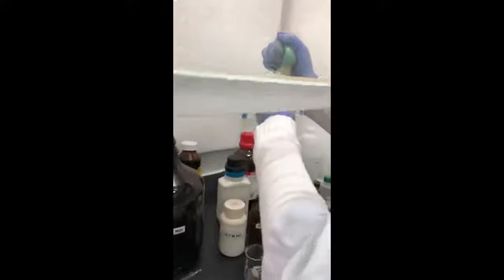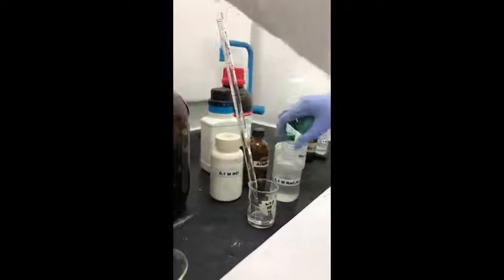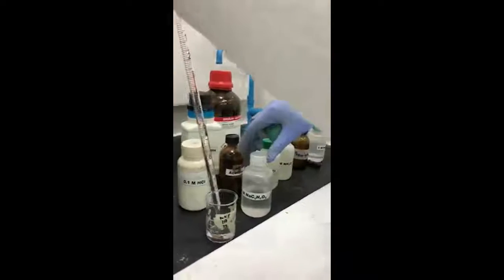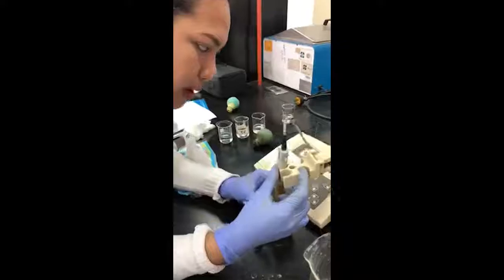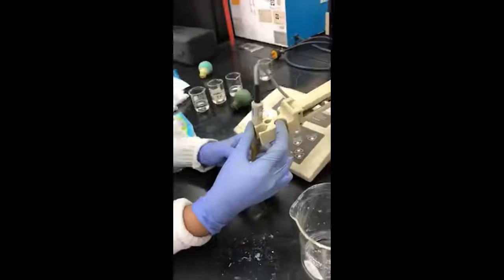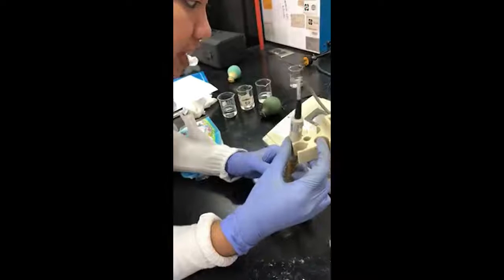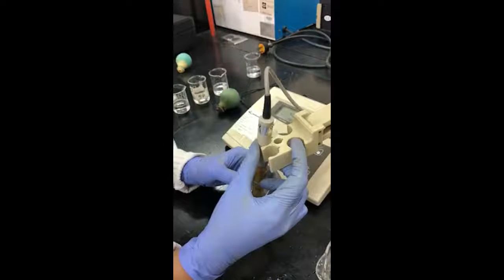We transfer 20 ml of each of the stock solutions into a small beaker separately. Then, we measure the conductance of each of the electrolyte solutions by immersing the electrode in the solution.